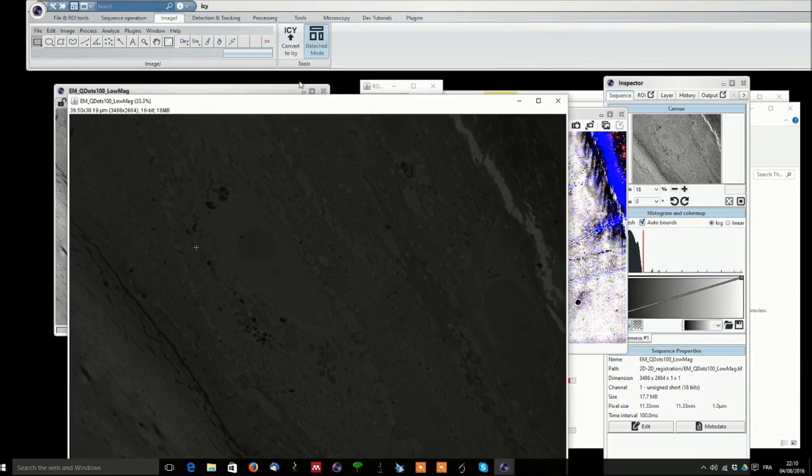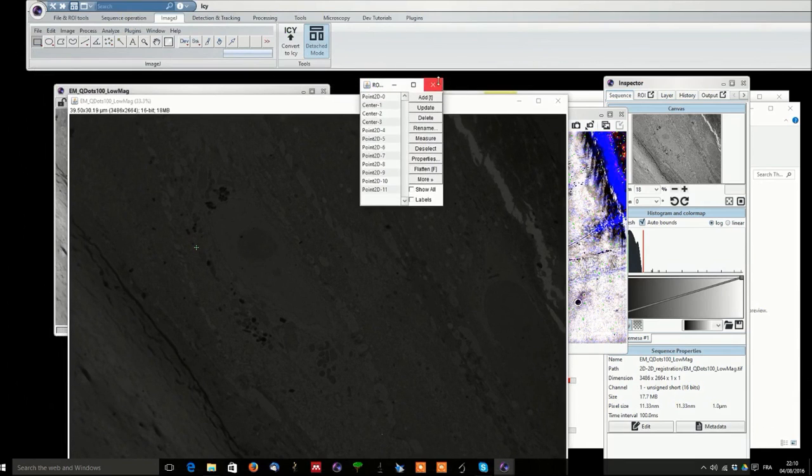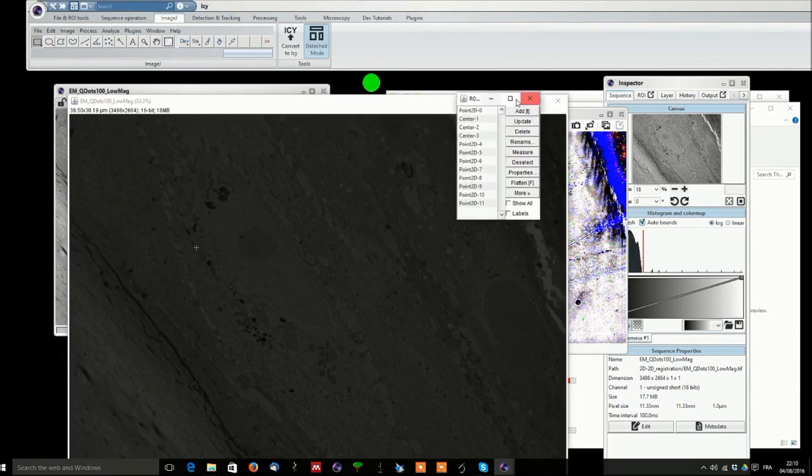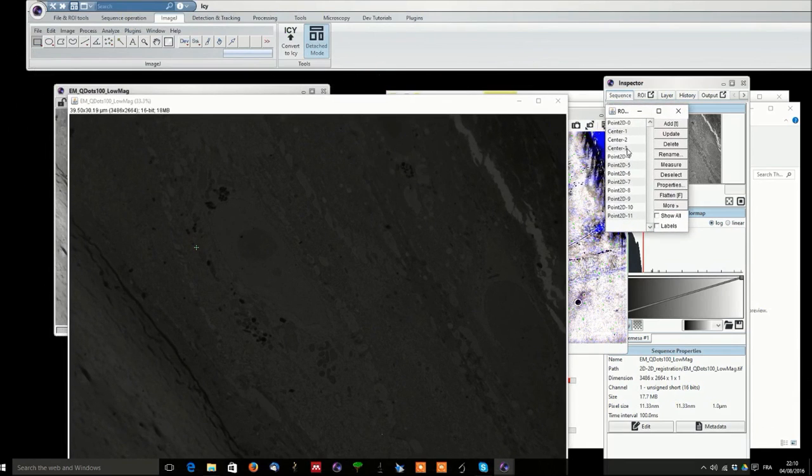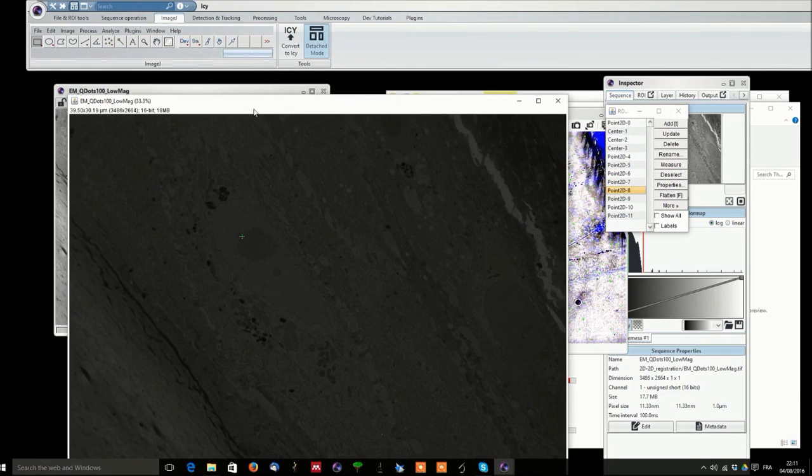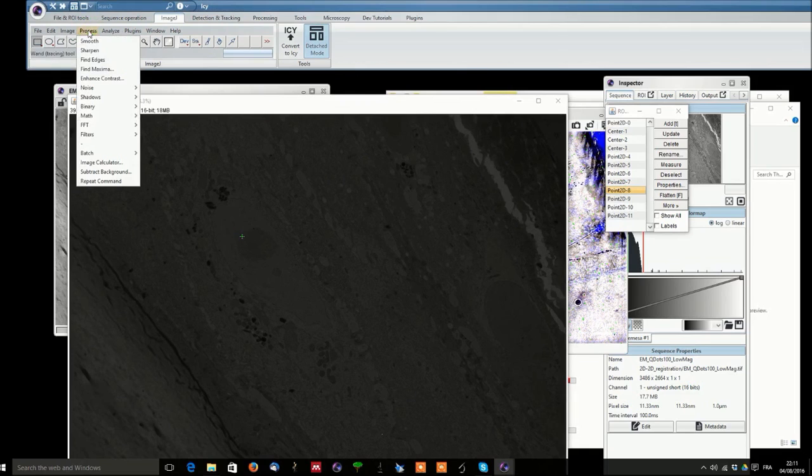Here you can do all the processing you are usually doing. As you can see the region of interest also transfer so you can find them back. And here you can do your processing as you are usually doing.